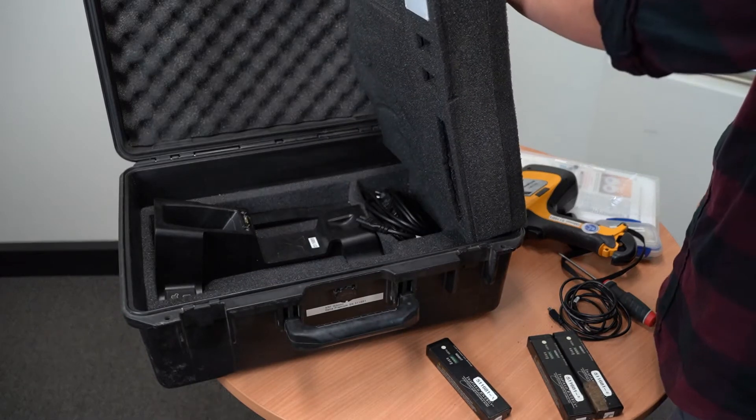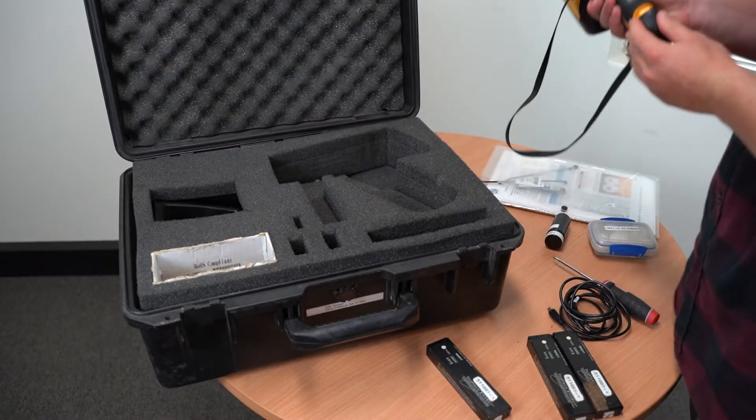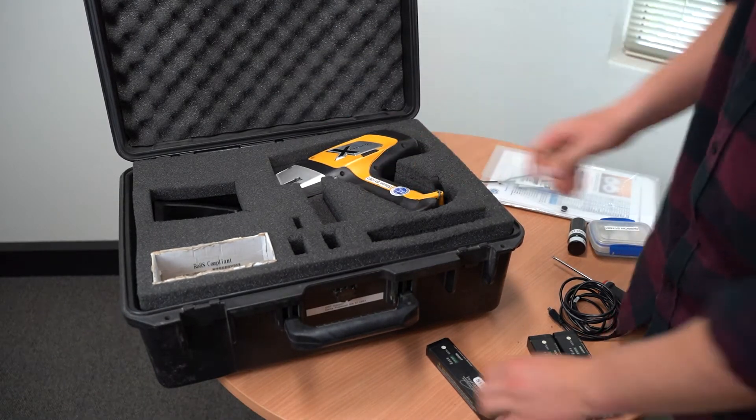Check your charging station and the cores are in the spot underneath the removable foam. Once you've removed the batteries from the instrument, place them into the designated spots and do the same for the XRA.